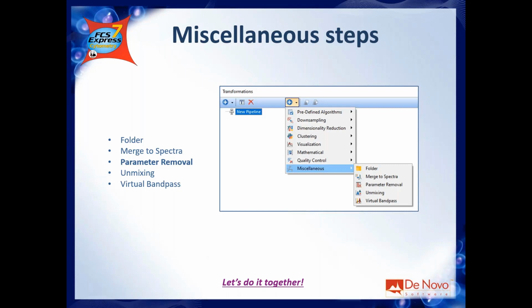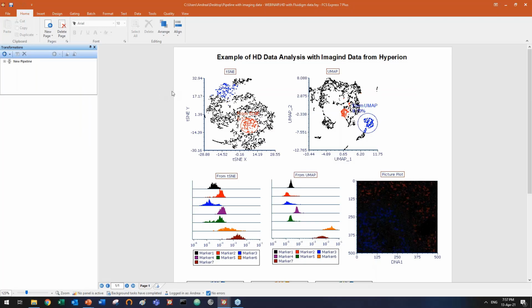And then you will have UMAP 1 and 2, tSNE 1 and 2, and so on. You will have like 70. But maybe at the end, you do not really need the scaled and the normalized. Those parameters were useful to actually run the pipeline, but they are not really useful at the end for you.